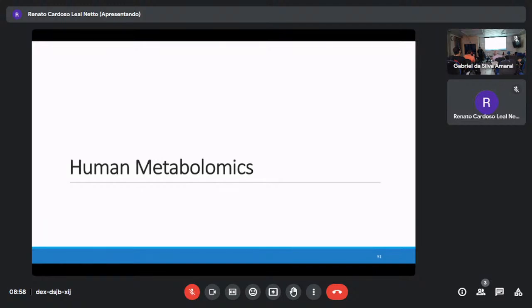First one is when you do microbiome culture, plant cell culture, you have to make a list. Define the media. Define the media. Now you know which one is in the media. So that one is okay.